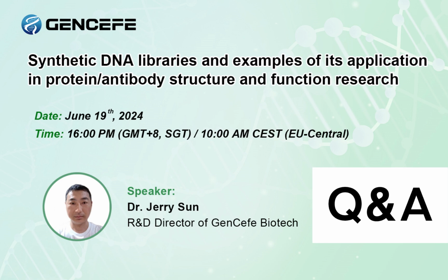Do you need a wild type gene? For example, if you have to screen an antibody library, do you do the mutation in the wild type gene, or do you provide a big library you can use for primary screening? Usually you need to have a wild type antibody. Based on this antibody, we then design the mutant libraries, because usually the wild type antibody has some affinity to the antigen. If you want to increase the affinity, you can do the modifications.